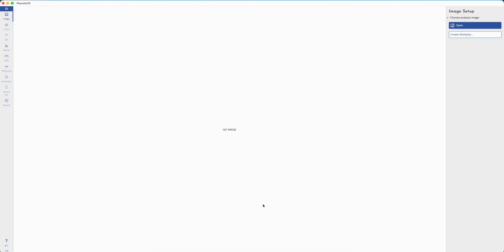You can simply bring them in, analyze them and compare them to what you were getting with ImageLab, and do all of the normal features and functions you would expect from a modern piece of 1D image analysis software.